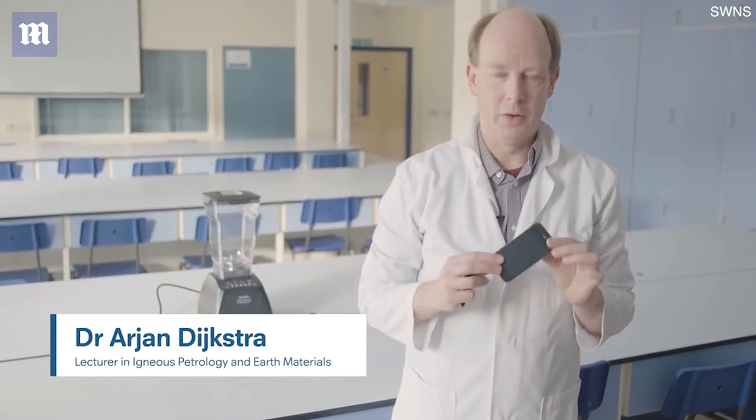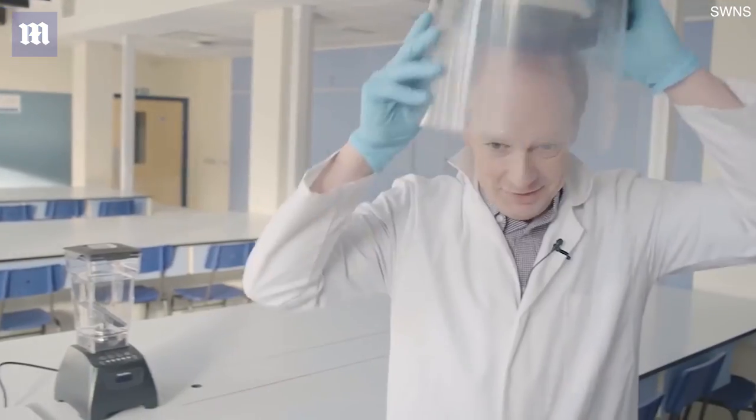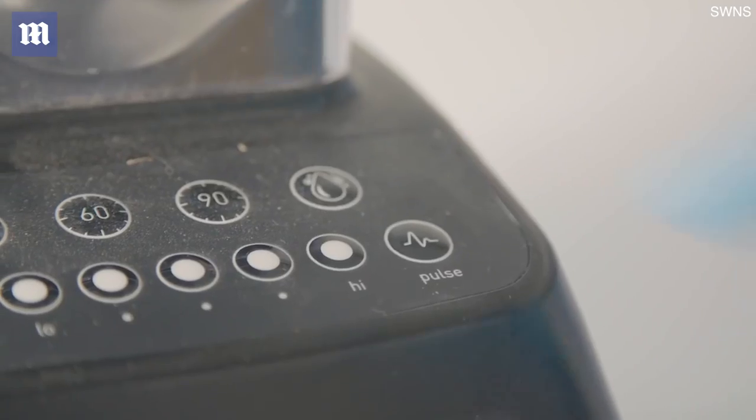If we want to analyze this phone and work out what it's made of, we need to grind it to a very fine powder. Put these on, just to be safe. We're ready to go.